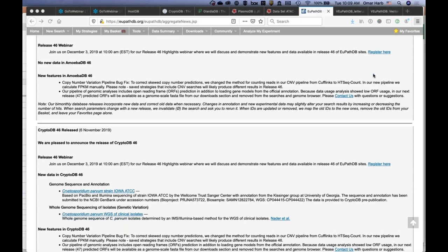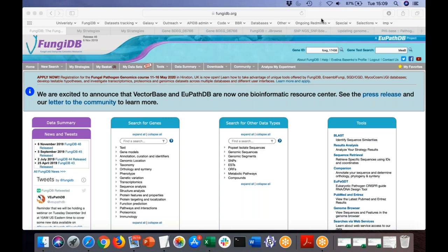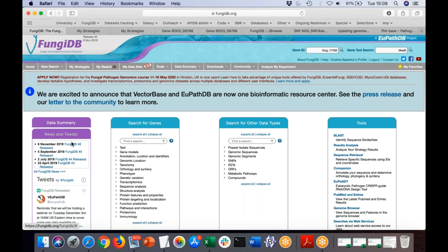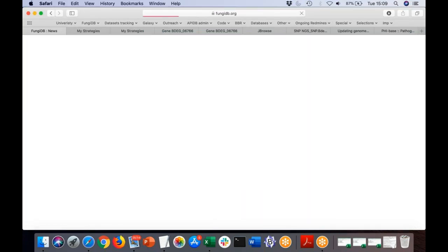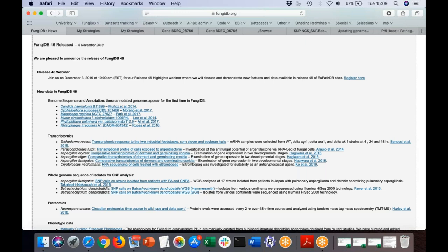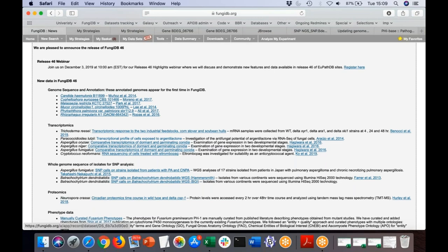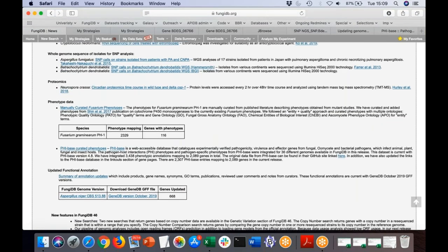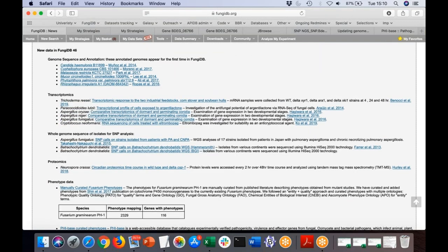Hi everyone. You should be able to see my screen now, which is FungiDB. I'll click on the FungiDB release news in the left panel. There are a few datasets loaded in the past release, including several genomes, transcriptomics, proteomics, SNPs, phenotype data, and updates for Aspergillus niger. We'll start by looking at a transcriptomics dataset specifically for Aspergillus fumigatus.